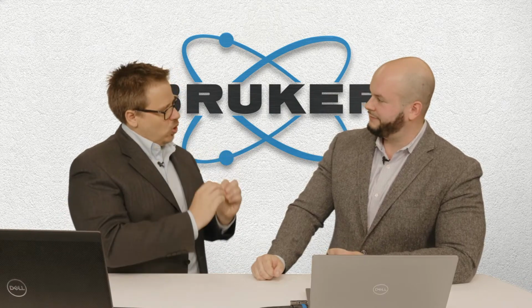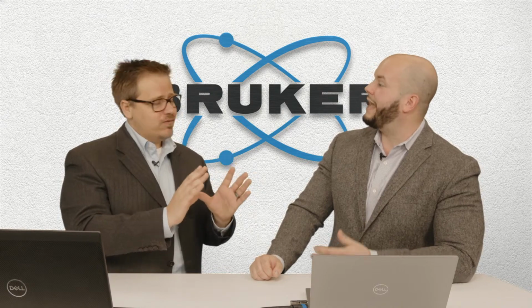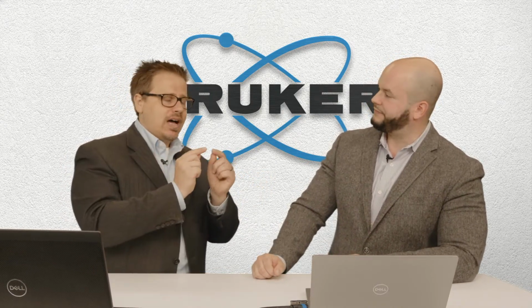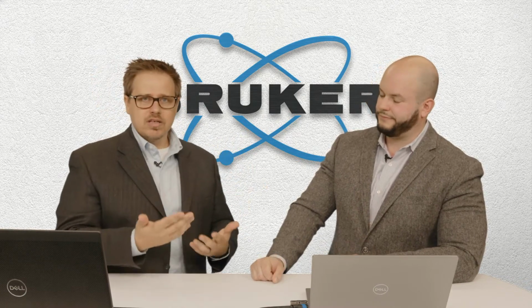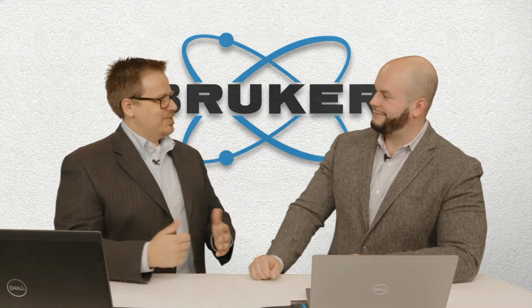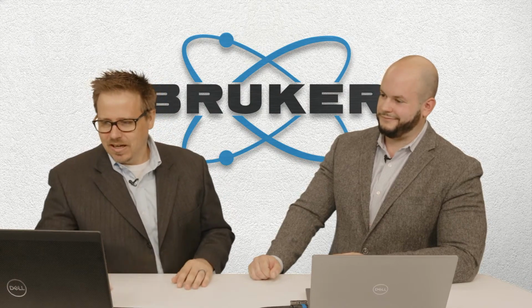Now, to make the pole figure, I guess the answer would be no. Right. To just make the pole figures themselves, that first step, no, you don't. But if you want to do the analysis, we need to know how each reflection relates. Exactly. So yes, in that case, you would need to know the space group. So go ahead, do your powder scan, get your result there. You'll be able to get it right from the databases, right?